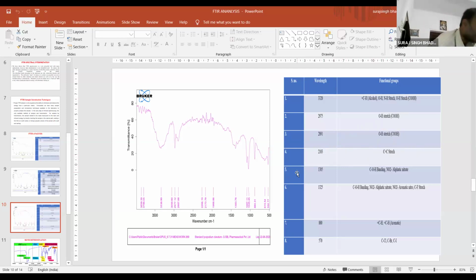So it is a different analytical procedure. These are the different molecular systems. So through this, you can analyze this type of FTIR analysis. Generally, in these small peaks, you have aliphatic compounds. You have compounds which have a single bond, not double and triple. Generally, the double and triple bonds are seen in the highest peak, and in these small peaks you can determine the single bond compounds, a single bond between two different corresponding atoms. So this is a spectral correlation in the FTIR.